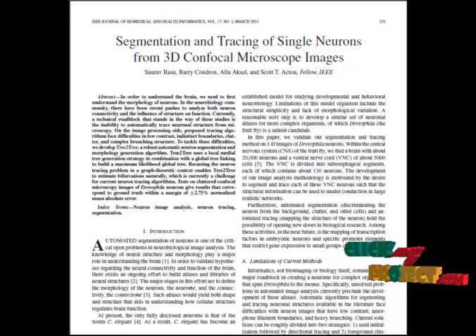If it belongs to the neuron, the pixel will be marked as 1 and other pixels are marked as 0. After segmentation, we trace the neuron with the original image. Here we trace the neuron by the use of the alpha-beta graph pruning algorithm. Finally, we map the segmented neuron to the original image.